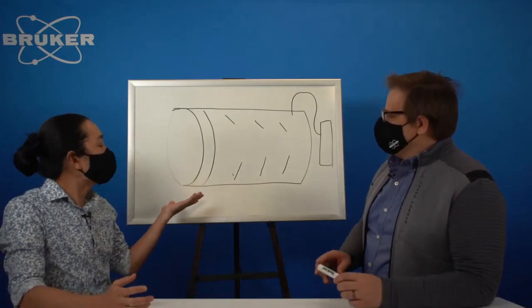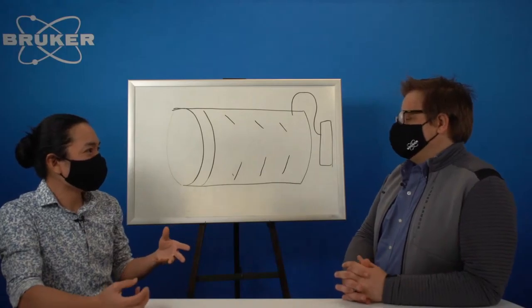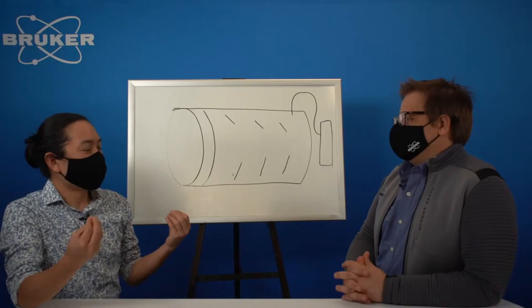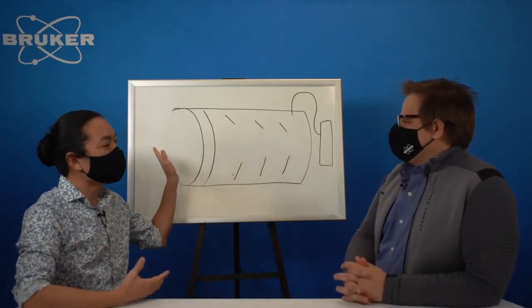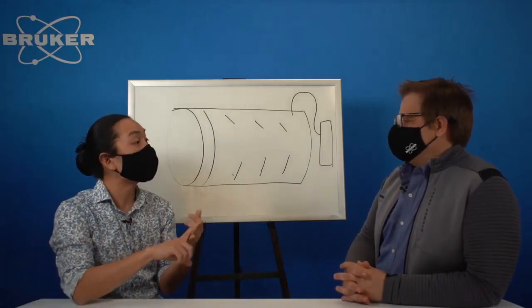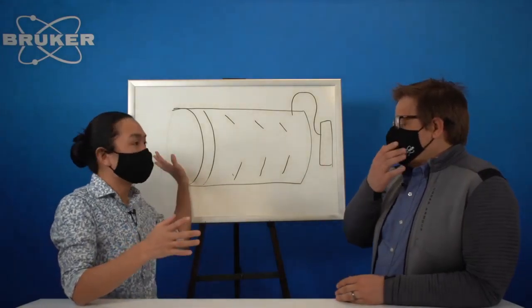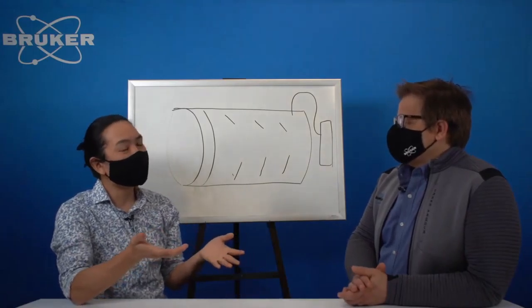I always like to think about it in terms of when you go to the eye doctor and they dilate your eyes, and then suddenly it's like, I can see sound. It's just overwhelming. With this, anything that comes in, whether it's the X-ray from your tube or things like sample fluorescence, which we'll talk about in a little bit, just floods in. So the good news is you get a lot of counts, but they're not always useful counts.